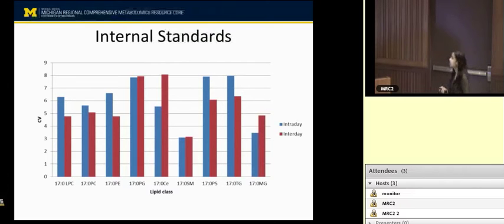So this is just one example from the data report that we give to the client, and this is the information that we collect. This is an example data set, and in this data set we had two separate experiments going on. These are NIH rats selected based on their training response, or selected based on their running capacity. So these are two different experiments we are trying to do, and I'm going to call them experiment 1 and experiment 2, just to be clear.